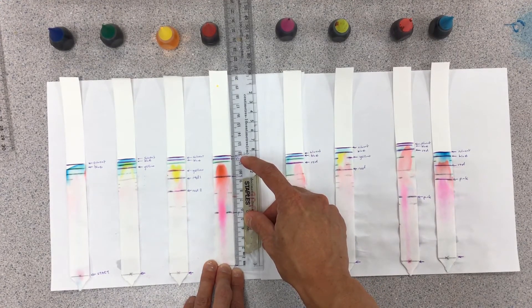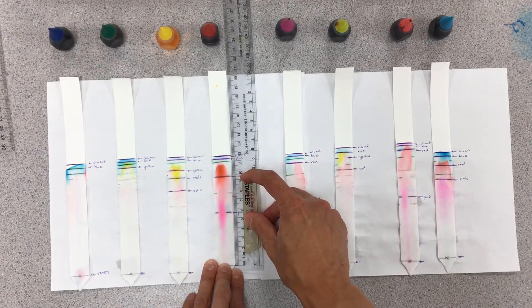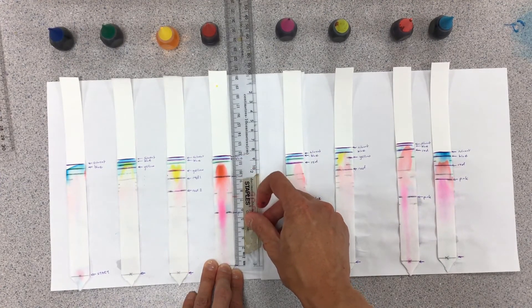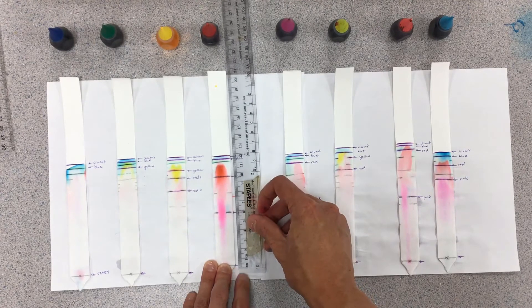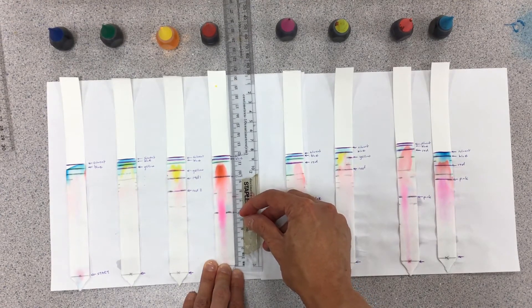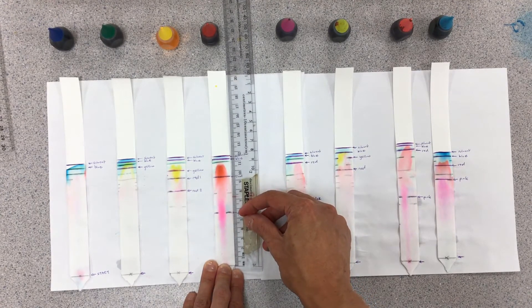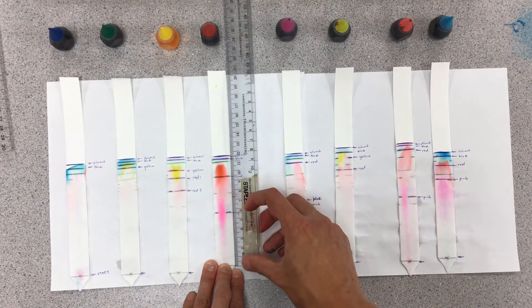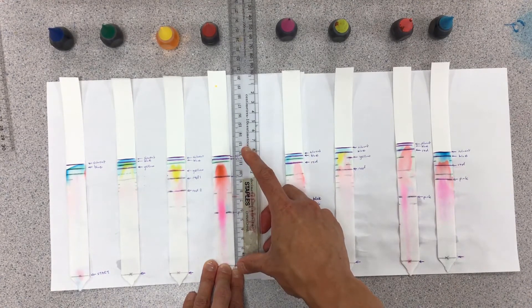The blue is a little bit shorter, maybe 11.2. We have a red line here, about 9.4 or so. We had a little bit of pink show up in this mixture, maybe about 5.6 or so. The ratio of fronts is just the solute distance divided by the solvent distance.